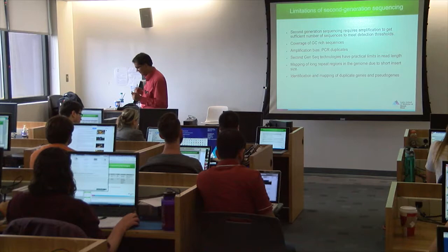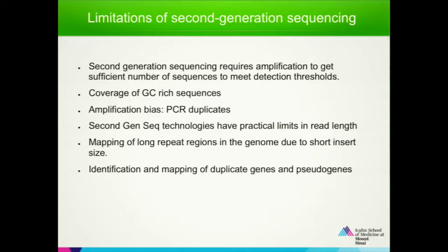So that means you have to go for longer read lengths, as long as possible. How long? If you ask me, how long should the read length be? 1,000 bases, 2,000, 3,000, 5,000, 10,000? If you ask me, sequence the entire chromosome without breaking it. For me, that is the ultimate read. No adapter ligation, nothing.